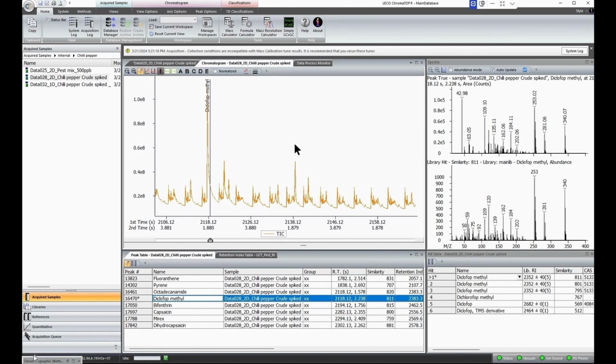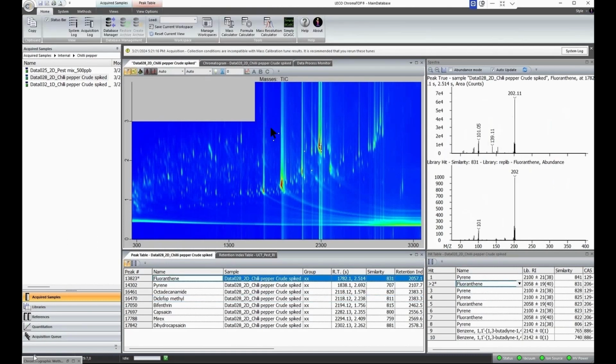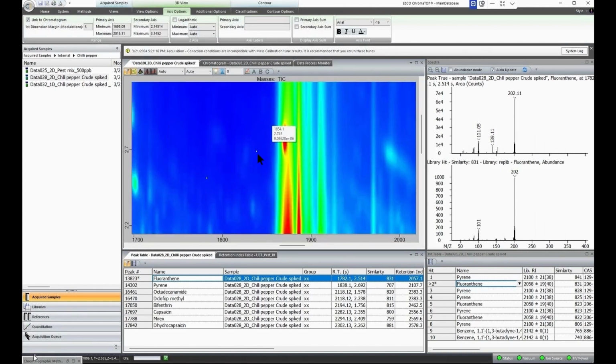But that's not all there is to it. So we just have seen two examples from pesticides. What about other types of contaminants, as I was mentioning at the beginning of this presentation? I spot two PAH components in this area of the chromatogram over here. And if we go there, they are even barely visible on a total ion chromatogram. So it will be very difficult to pick them unless you have a powerful non-target screening approach and using LECO deconvolution.